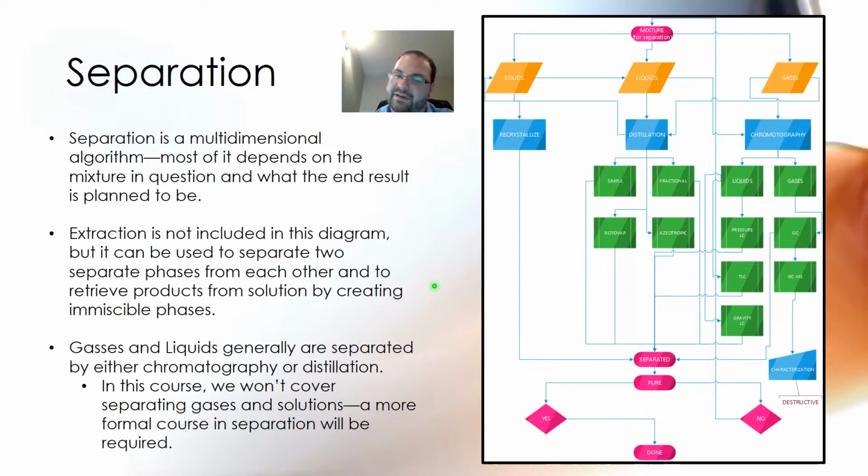You can just use the GC function on the instrument and measure the retention times, but it will also feed through the mass spec, and you can use the mass spec end of it. When you run something through a mass spec, though, you're destroying it because it ionizes the sample and runs it through quadrupoles, and then you get mass charge ratios out of that, and then you can determine what kind of compounds you have based on fragmentation patterns. This is how a lot of instrumental techniques are done, particularly in protein work. MALDI-TOF is a type of mass spec oriented analytical method where you're taking a protein sample and actually ionizing it with a laser on a special matrix.